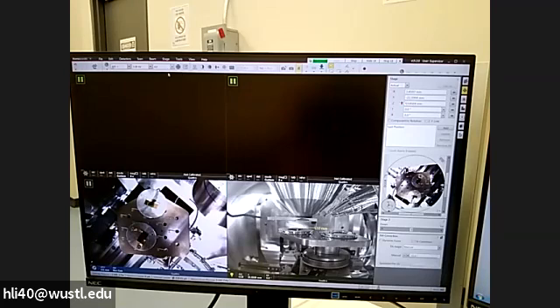The next thing is the spot size. So for the spot size, we have a list here. If you see, we have 1 to 7. A larger spot size gives you more electron beam, so you will have higher signal counts. But more electron beam, larger spot size, means poorer resolution. So you need a combination of signal counts and resolution to get the best looking image. So normally we start from 3.